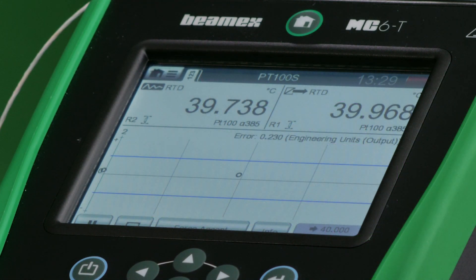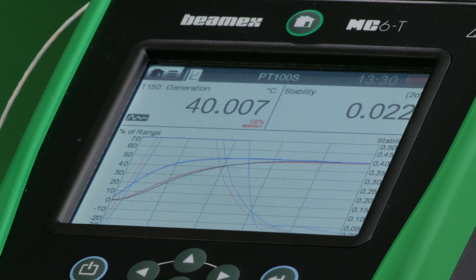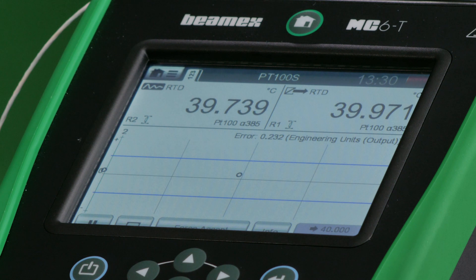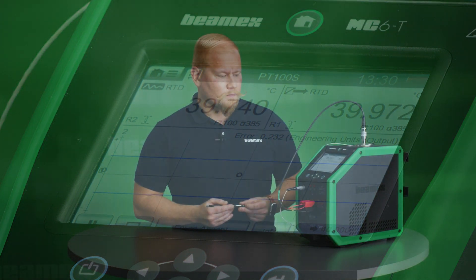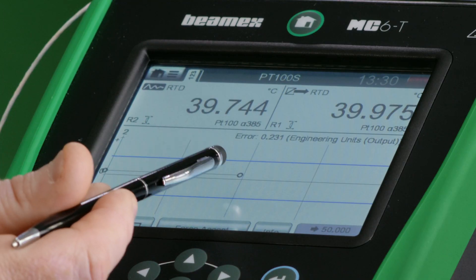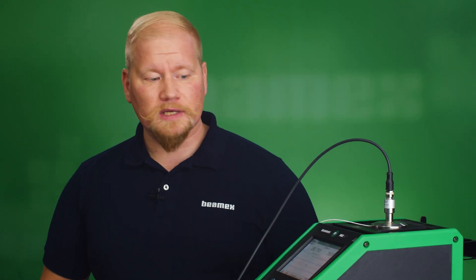We're now very close to reaching our second set point. In reality, a technician wouldn't need to be following this, as it's all automated — they could be preparing for the next job or calibration. I can see my stability is getting very close to where it should be, and any second now it will record the second set point. The second set point is now reached — a nice green line has been drawn, and the third and final set point of 50 degrees Celsius has been given.